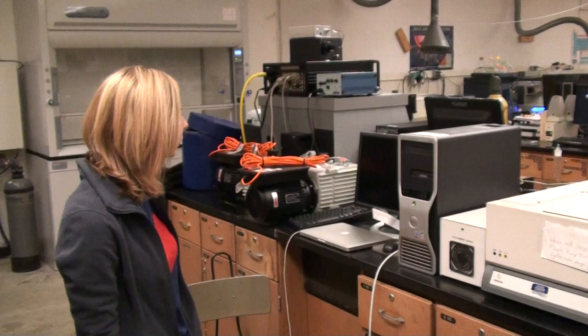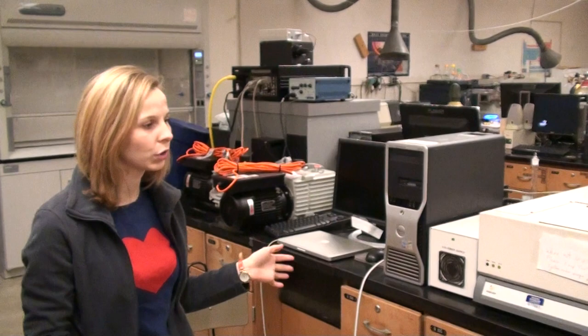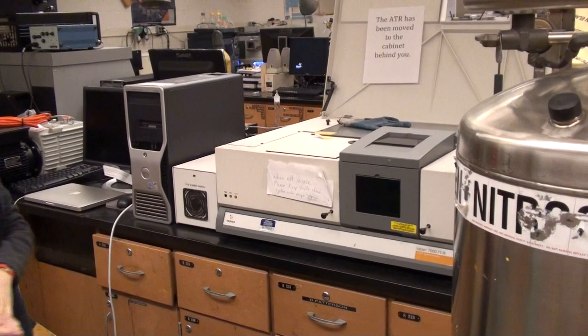So what is this instrument and what does it do? This right here is FTIR, which is what it's commonly referred to, but it's actually a Fourier Transform Infrared Spectrometer.